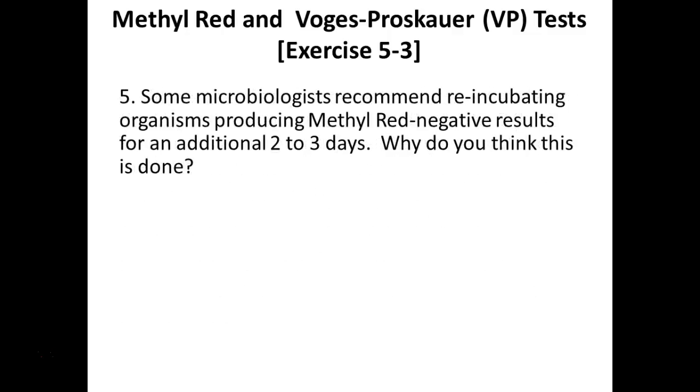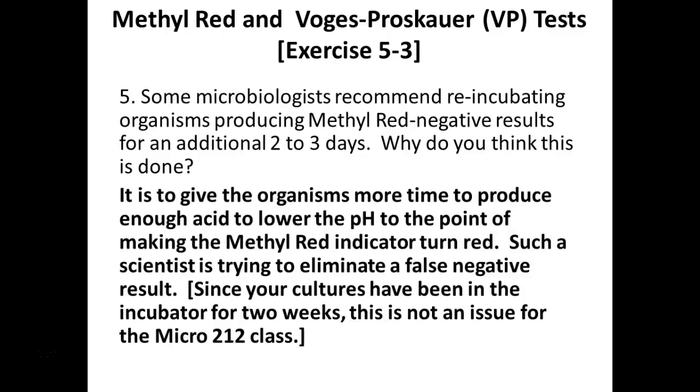Some microbiologists recommend re-incubating the organisms producing methyl red negative results for an additional 2 to 3 days. Why would you do that? Why would you incubate it longer if it comes out negative? Let it grow, and if it grows more, it's going to produce more. It's going to produce more acid, so hopefully enough that it would get within that range. Again, we've already done this with your organisms, right? So if it was supposed to be positive, it came out positive for most of you guys.